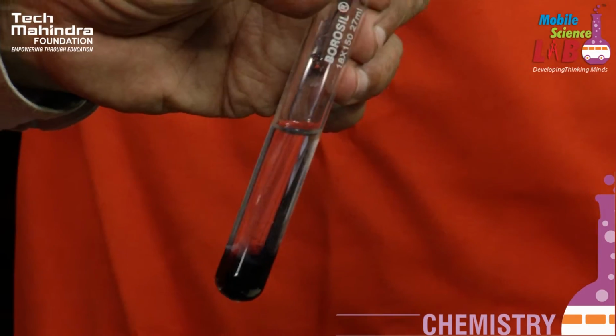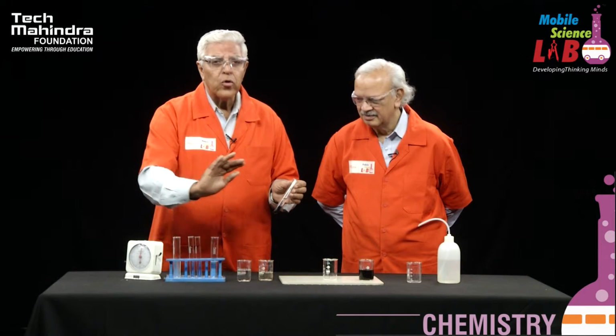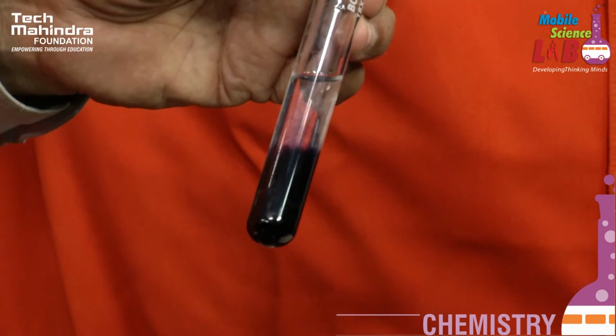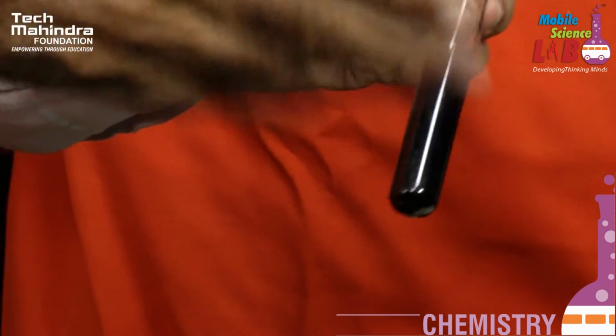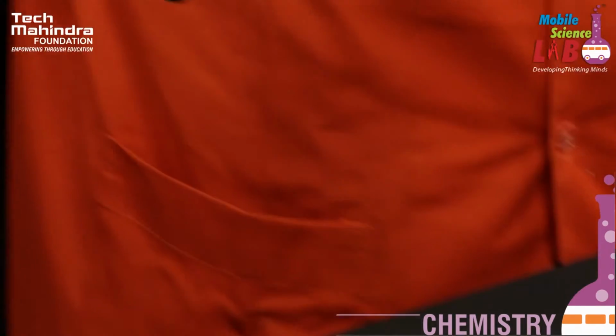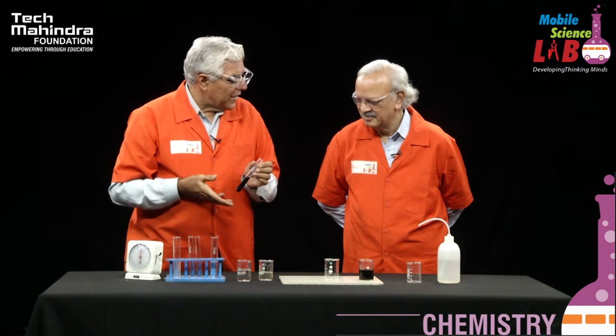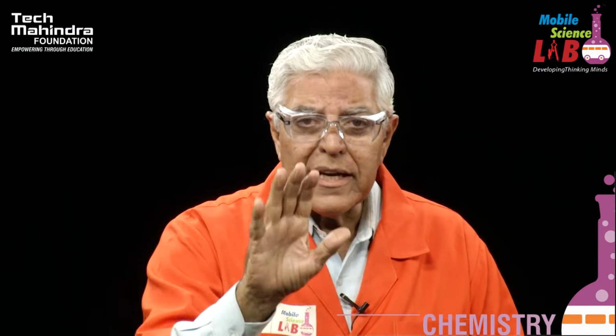This reaction has got 2 steps. The first one is a reaction between persulfate and iodide. It produces iodine in a slow manner. When the iodine is being produced, to stop the iodine from reacting with the starch which we had added in the earlier reaction, what you saw is that the blue color did not come immediately but came after 1 minute. The reason is hypo has got the tendency of holding on to the iodine much faster than the starch. So it takes a little time.